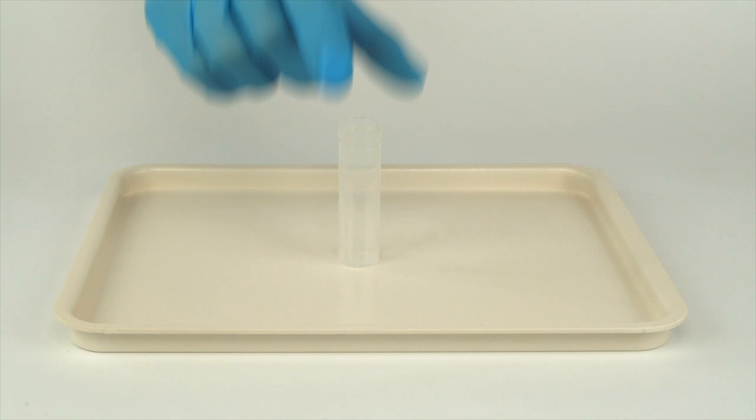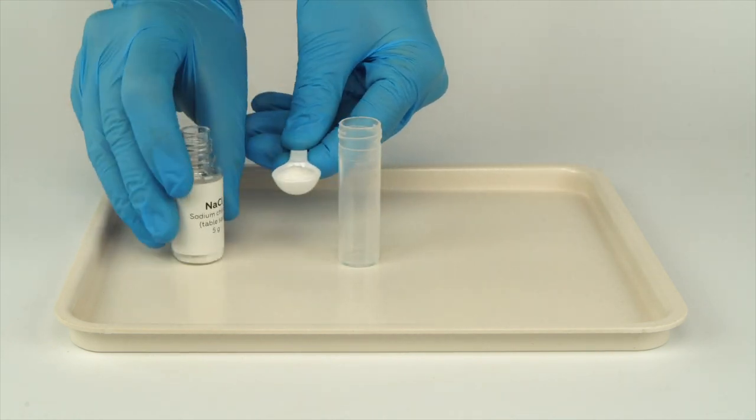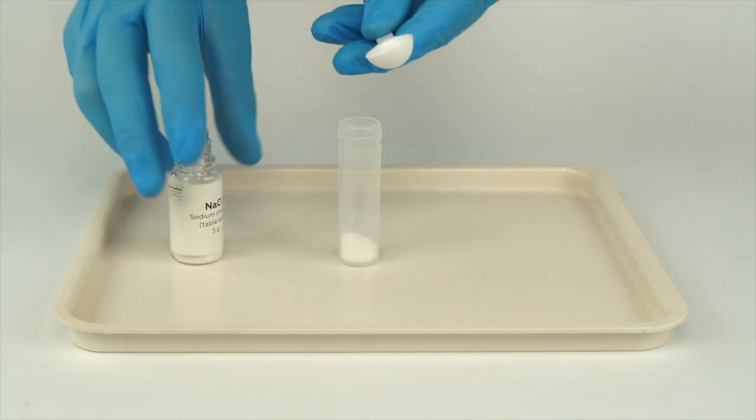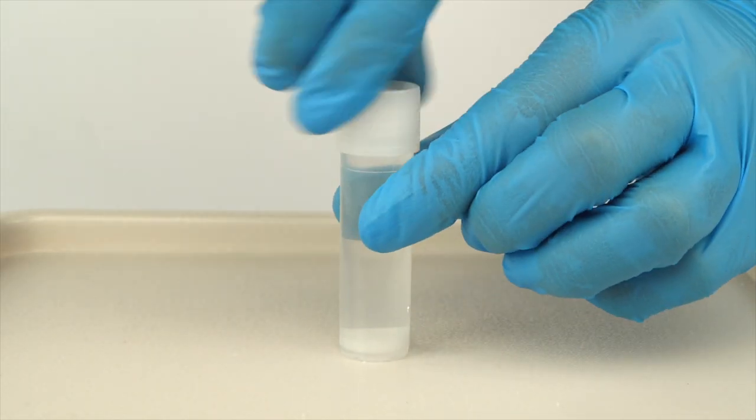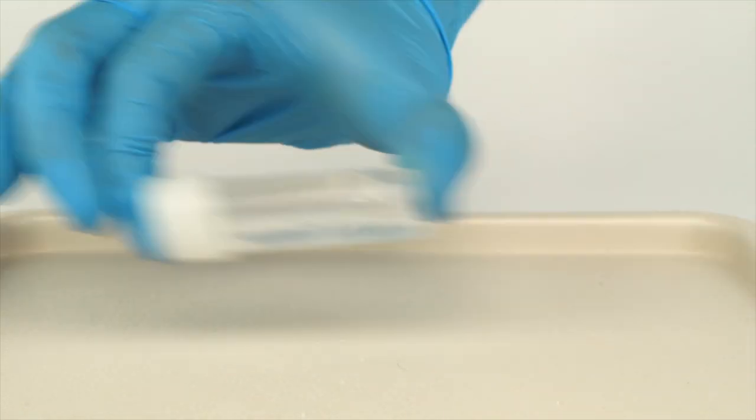Prepare some salt water. Pour one big spoon of sodium chloride into the vial. Fill the vial the rest of the way with water. Cap the vial and shake it until the sodium chloride dissolves.